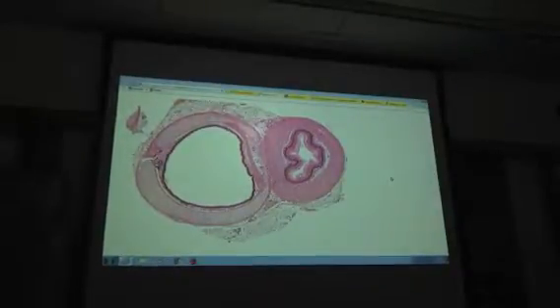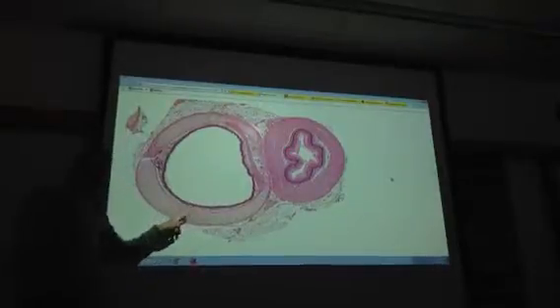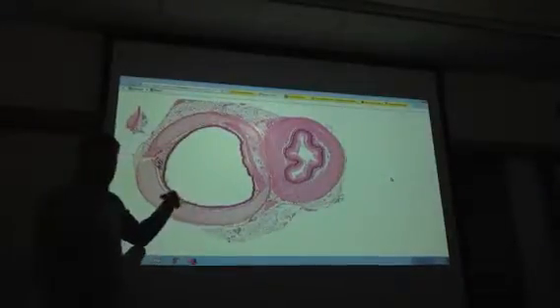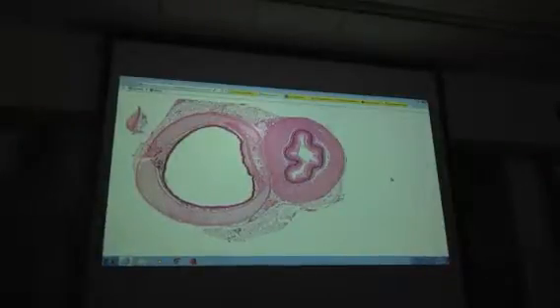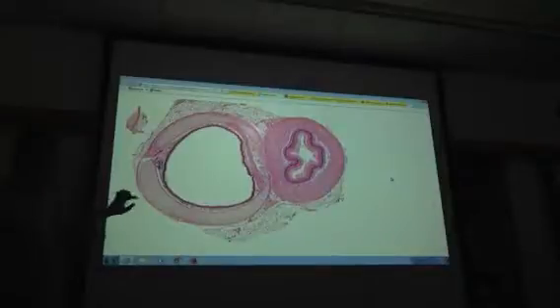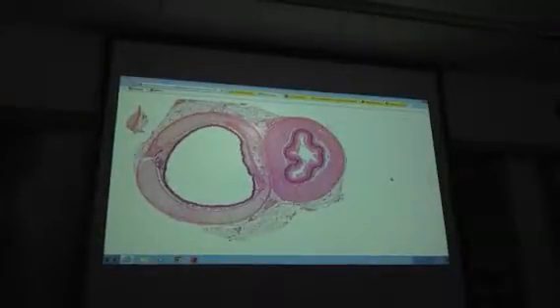Well, this is the epithelial layer. It's tough to see there, but what kind of epithelium is it? Pseudostratified ciliated columnar epithelium with goblet cells, right? Well, I'll give you a better picture of that in a second. This area right below it, very thin, would be where the lamina propria is, and then you get into the submucosa area. That's where you're going to find the seromucous glands.